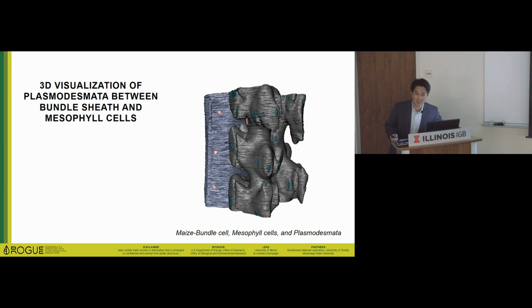I couldn't hear your question. Sorry, you asked him about labeling the chloroplast? When you create the transgenic, would you label the chloroplast with GFP or something, sort the cells using FACS, and stain the cells separately instead of following the machine? Maybe that's a little bit high scope, compared to just taking the image. Is there any difficulty in C4 plants in doing this cell sorting?